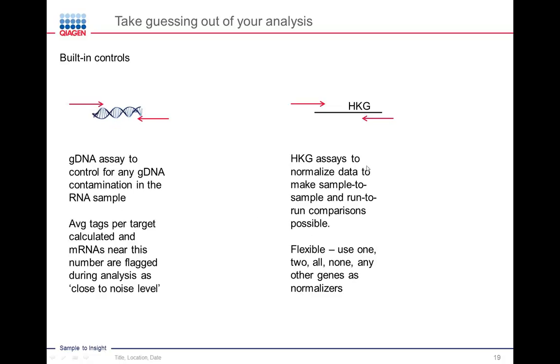The housekeeping gene assays are used to normalize data and make sample-to-sample and run-to-run comparisons possible.